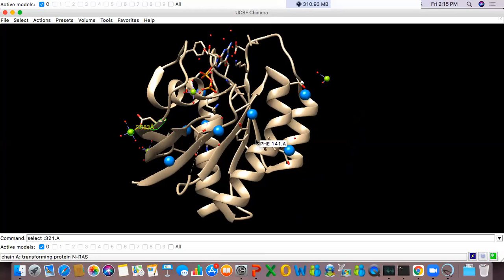Okay, there's nothing called a hydrophobic bond. The only bonds you have are defined as covalent bond, or you can say hydrogen bond. But again, the hydrogen bond definition, as I said, is set empirically, and you can find the hydrogen bonds between them. That's one way, but then again you have to use certain criteria. One thing which keeps coming up in protein structure analysis, in trying to determine interactions between ligands and figure out contacts, is the Euclidean distance between atoms.